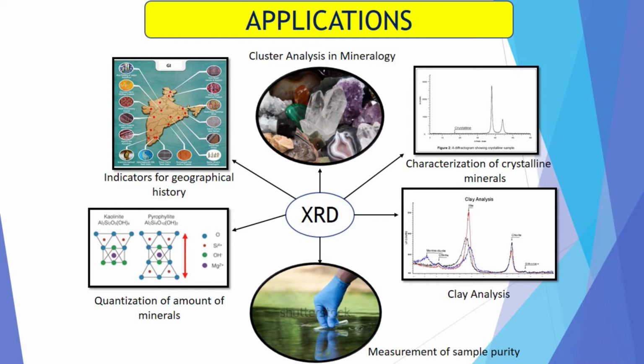Now we will see what the applications of XRD are from the geological and geochemical point of view. In XRD, as we know, we can know the crystalline and amorphous nature of the material. We can know the bulk mineralogy of the sample. We can separate the clay from the bulk sample and know which clays are there. We can know the stress and strain using the Debye-Scherrer equations, and we can also use quantitative methodology to know how much of each mineral is present in the sample.